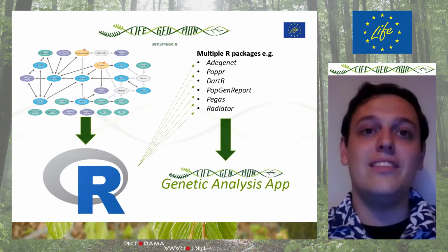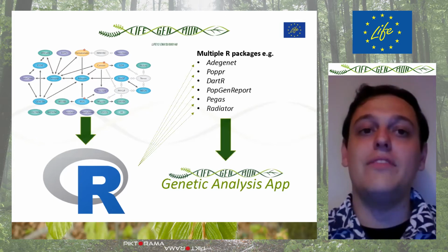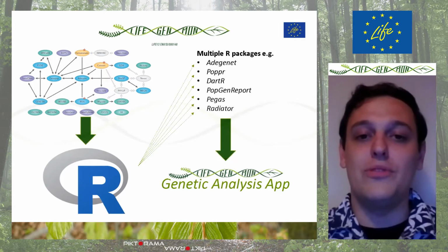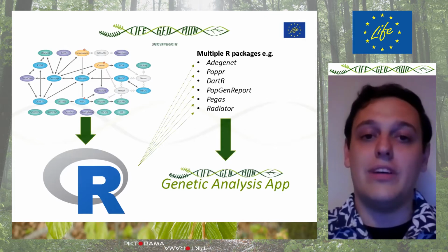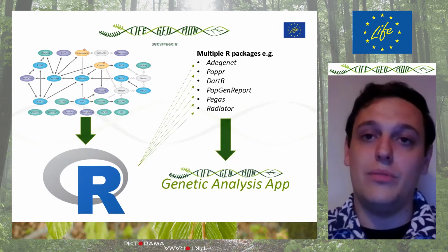Again, this can be an incredibly daunting experience and almost entirely inaccessible for someone who doesn't have prior R coding experience. This is where the population genetics analysis application that we've developed for use in the LIFEGENMON project comes in. We've created a simplified, clear pipeline almost entirely within the R environment through the aggregation of several of these packages, their functions, and unique scripts that we've written.